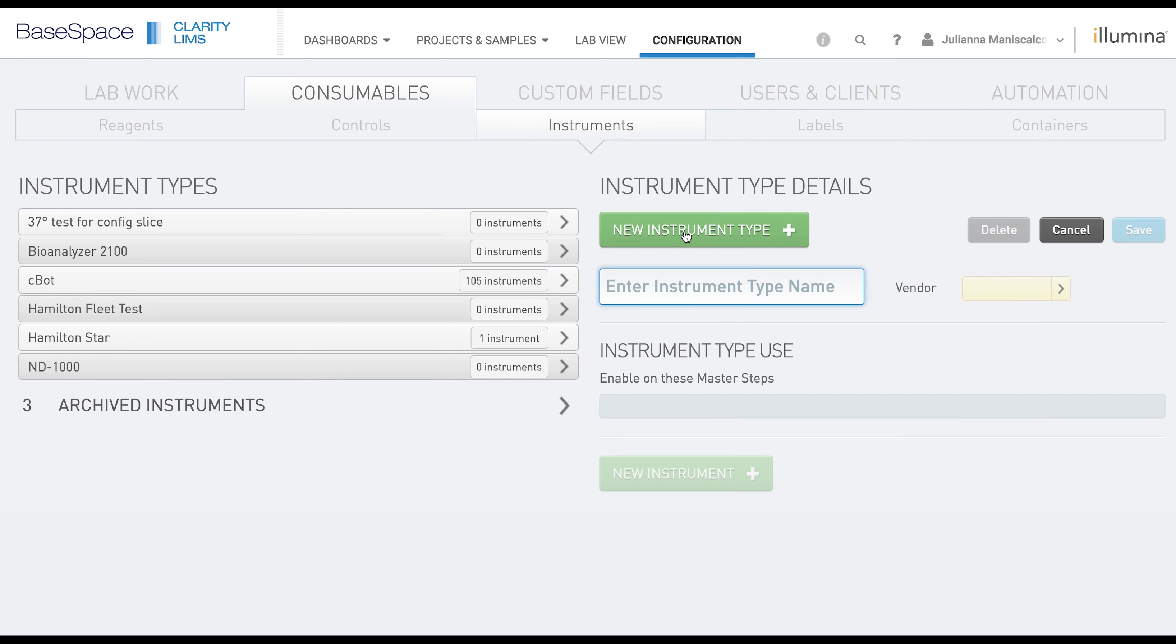You have to give the type a name and a vendor. If you do not see the vendor in the dropdown, you can directly type into this field and it will add a new one.